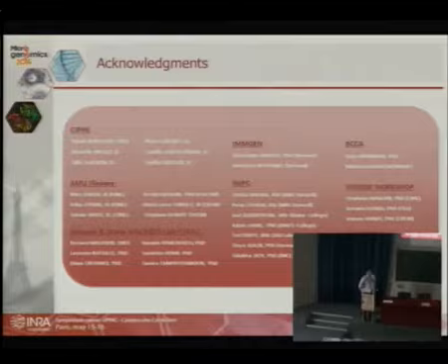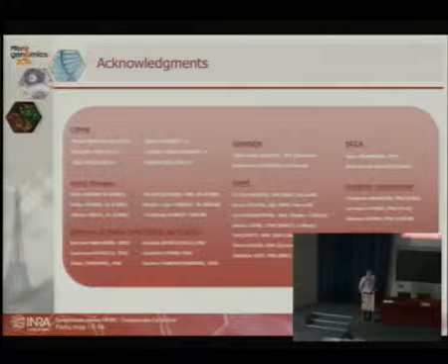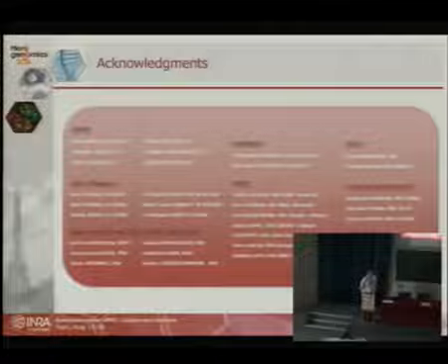Just a question about the multiple markers that you can use. You indicated you're up to 17 and perhaps up to 20. I guess that refers to colors. But for us that do transcriptomics, we do not want to fix the cells because we won't be able to measure the mRNA afterwards. How many markers do you think it's feasible to use if you're limited to extracellular markers?